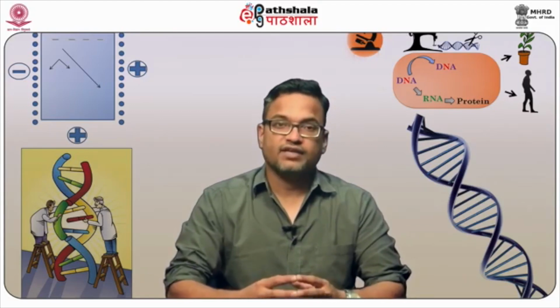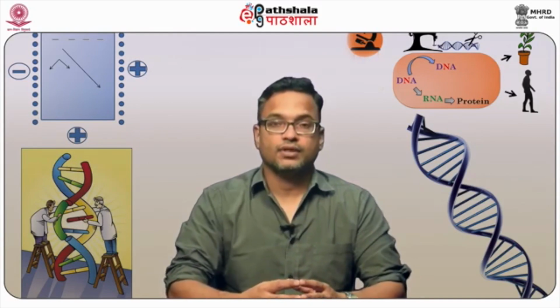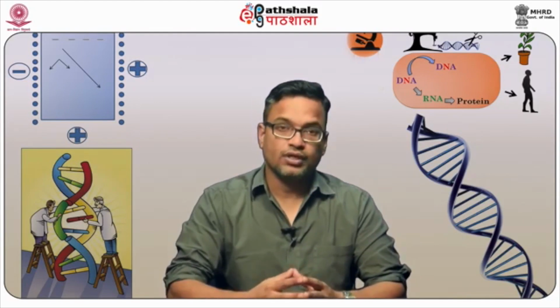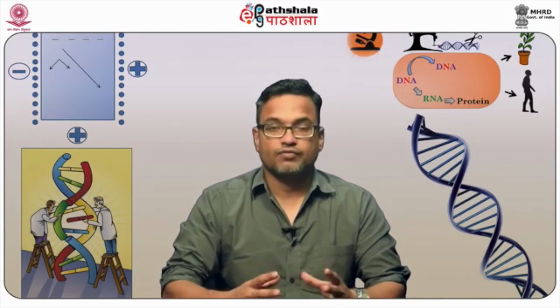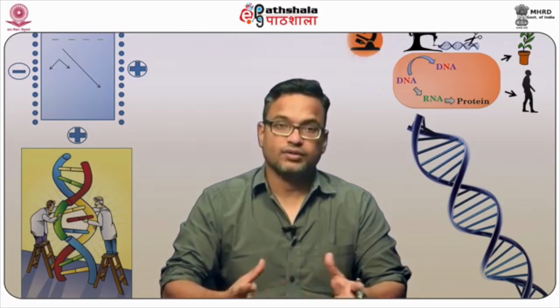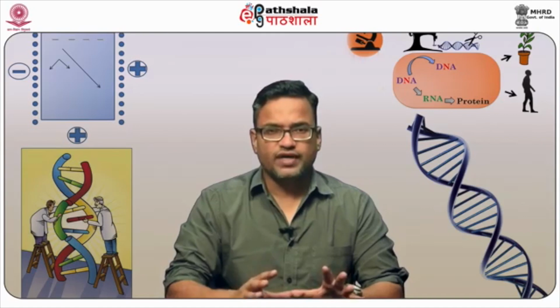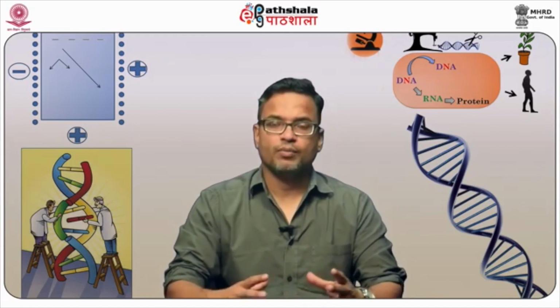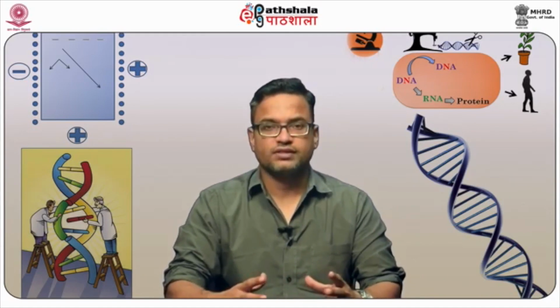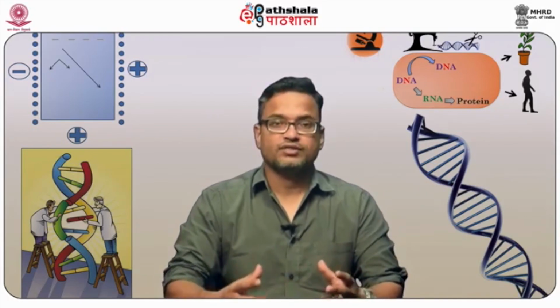We require these magnifications, and microscopes give us that tool, which allows us to magnify a smaller object into a larger image or form. Now, how do we magnify it? The magnification takes place by using convex lenses. It could be a single convex lens, or a combination of a couple of convex lenses to amplify or enlarge a smaller image.